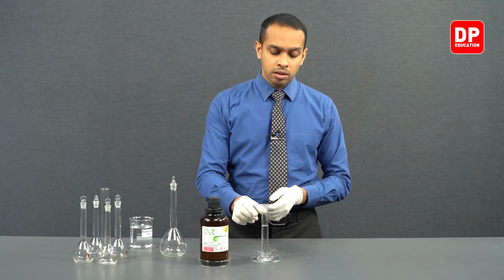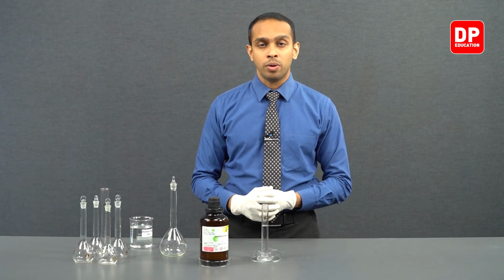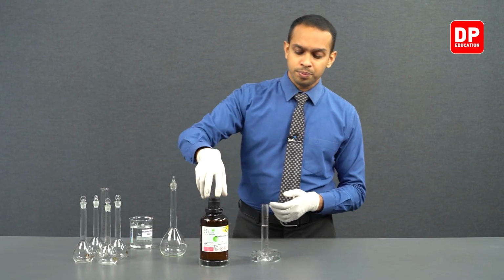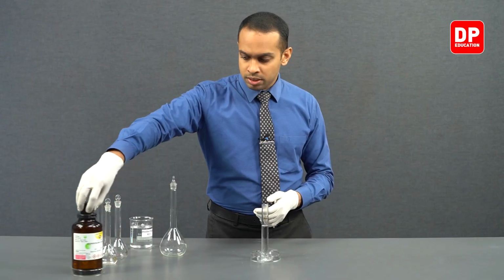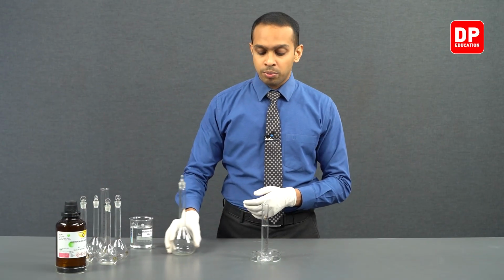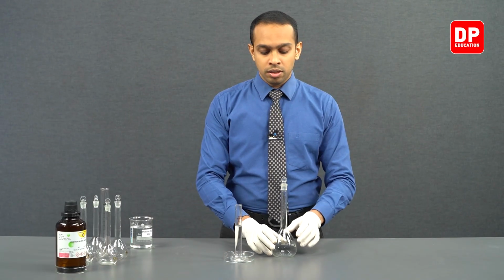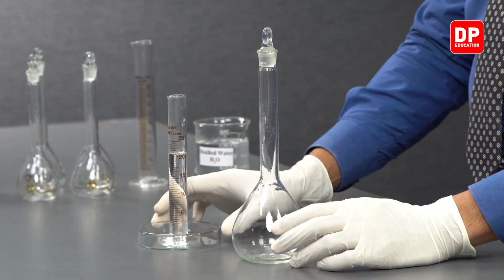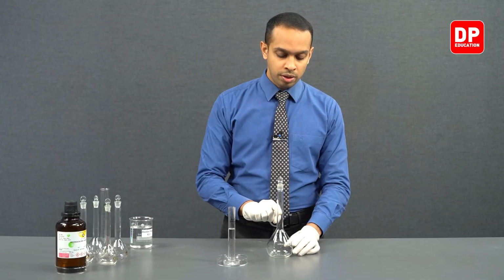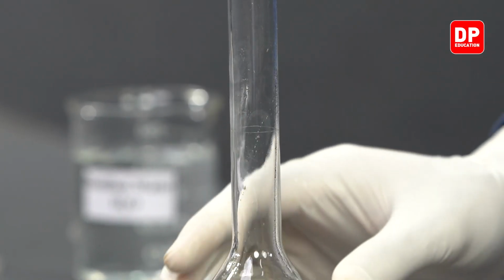So now, after we have measured exactly 21.5 cubic centimeters of our hydrochloric acid, we can keep the acid reagent bottle aside, and we can bring in our 250 cubic centimeter volumetric flask. And please note that there is a calibration mark over here.